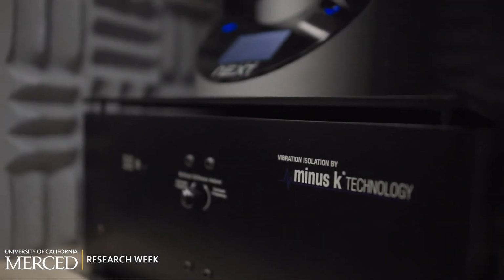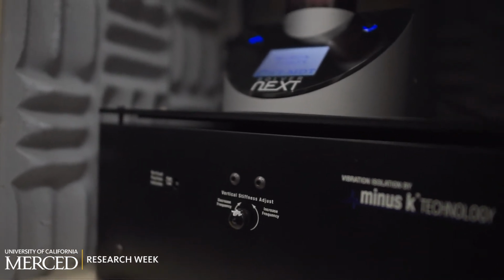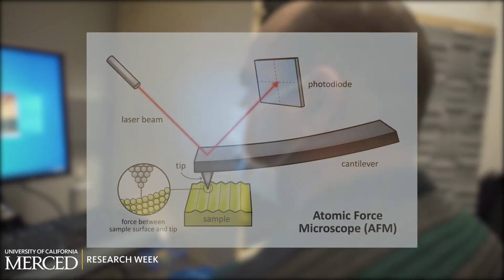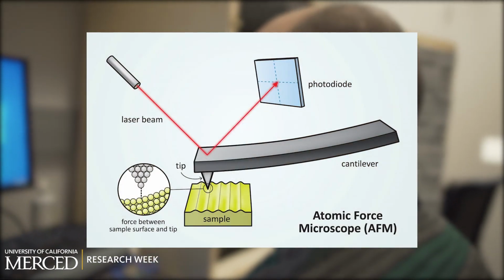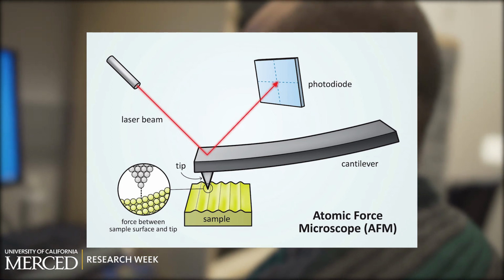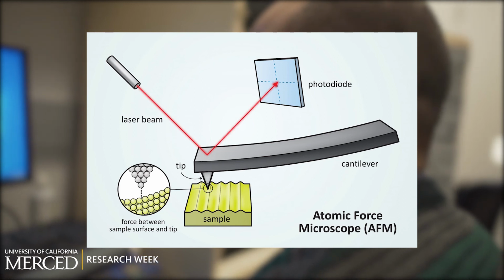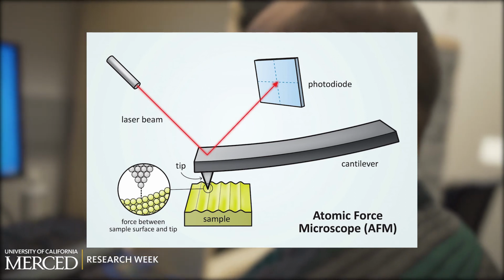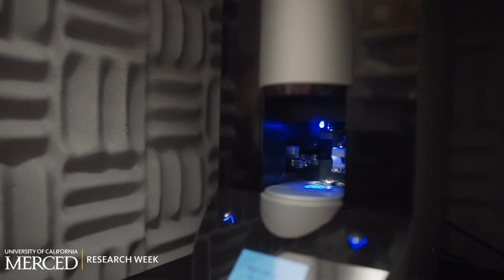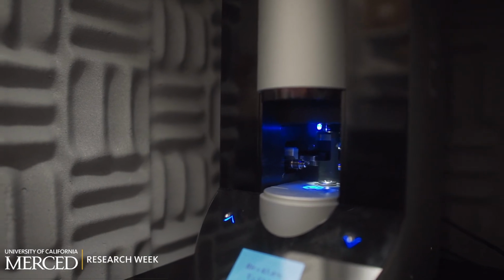Atomic force microscopy (AFM) is a surface scanning technique that has sub-nanometer scale resolution. AFM uses a laser beam deflection system where a laser is reflected from the back of the reflective AFM lever and onto a position sensitive detector and uses feedback loops to generate data of interest. AFM is used for non-destructive surface studies. AFM provides a resolution 1000 times better than optical microscopy's resolution limit.